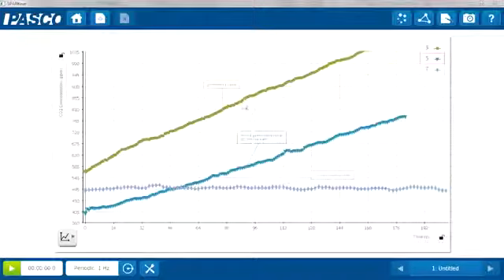On my screen here, I've got germinating seeds in green and the non-germinating in the blue with diamonds. So you can see that the germinating seeds had a significant increase, or caused a significant increase, in the carbon dioxide in the bottle, while the non-germinating seeds did not. And that's a good way to bring in the connection of cellular respiration to the energy needs of an organism and their cells. The students will be able to see that the germinating seeds are growing and make the connection that that growth requires energy.